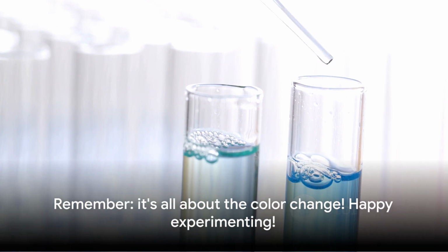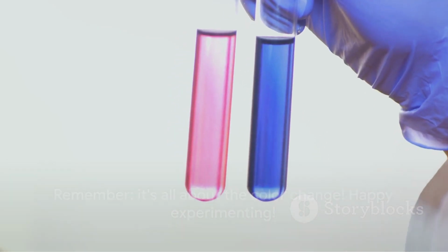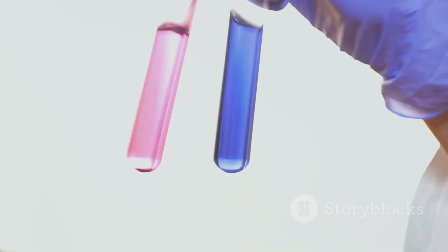So the next time you come across a complexometric titration, remember, it's all about the color change. Happy experimenting!